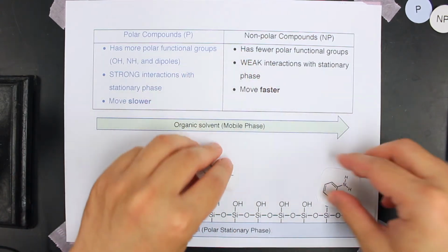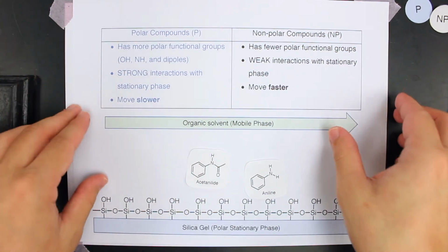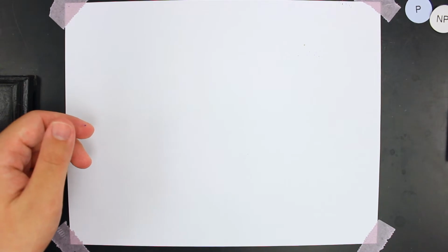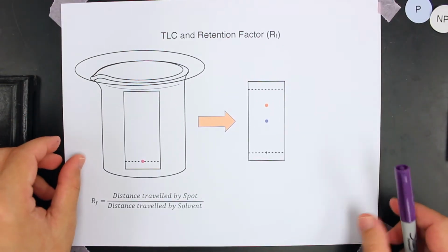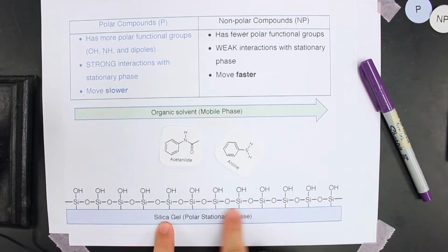Oops, flip that over there. Now, if this is a little abstract right now, even with this demonstration, don't worry. I think after seeing the experiment, you can see how this technique works more tangibly. Now, we were talking about a stationary phase, and that stationary phase, let me bring this back for a moment here, is silica gel. Now, obviously, this doesn't exist in a vacuum.